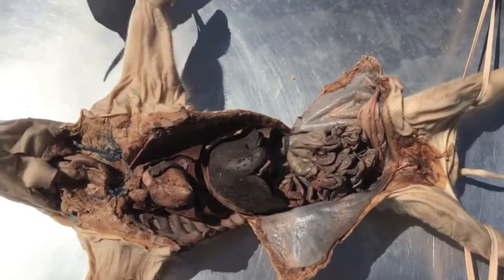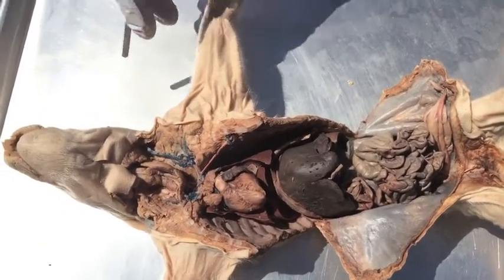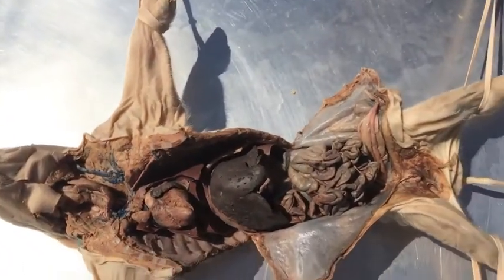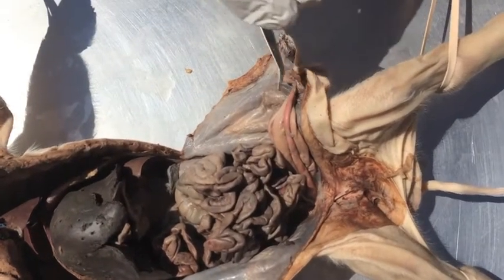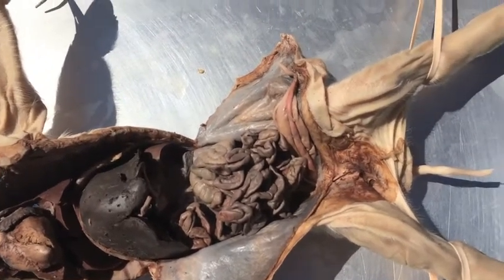Okay, so this is our pig. The start is the skin, which is the structure all around the pig. It functions to protect the pig and to regulate body temperature. Next we have the umbilical cord, which is located right here. It functions to transport nutrients to a fetus.